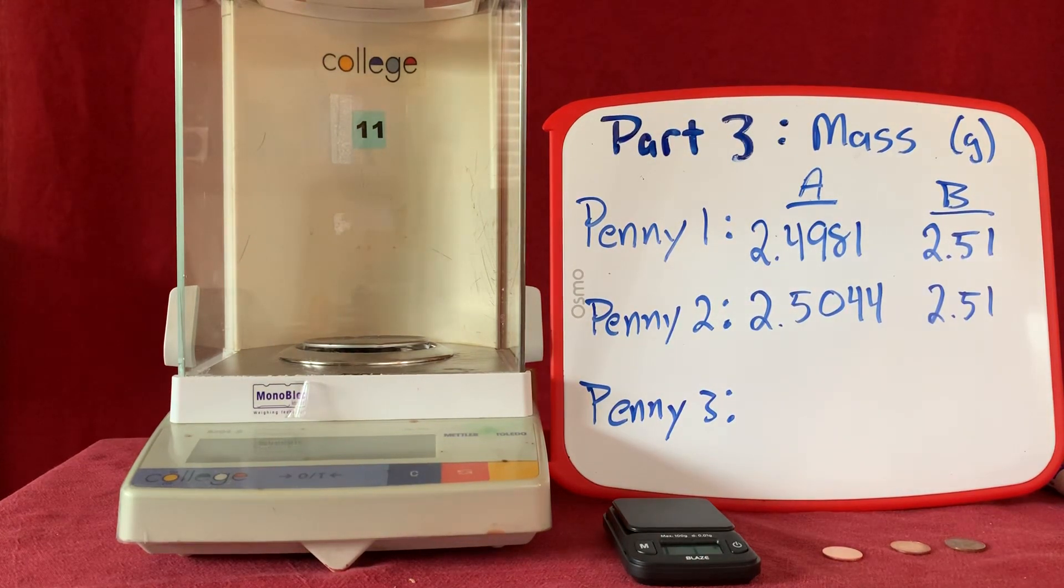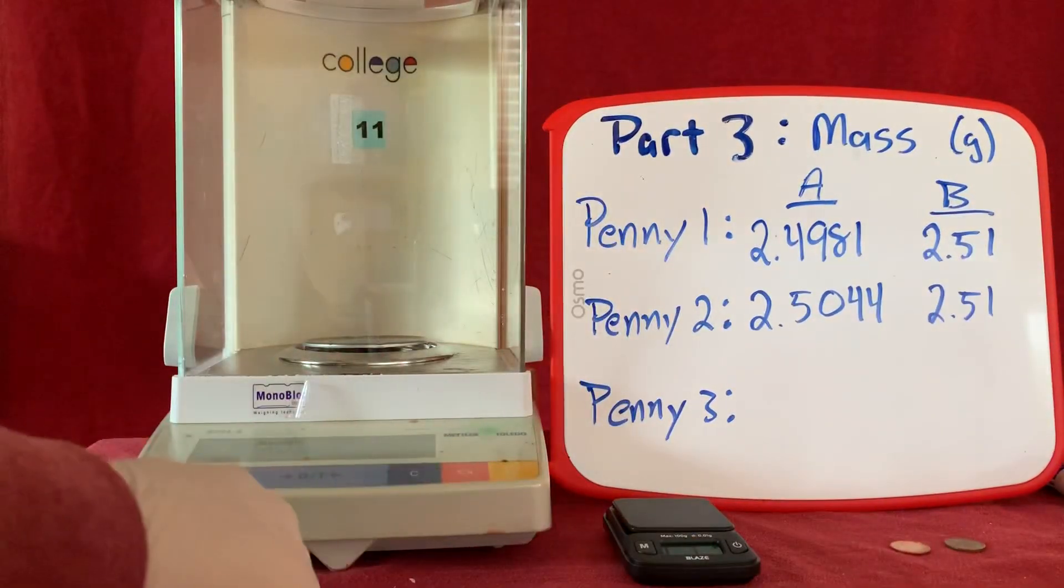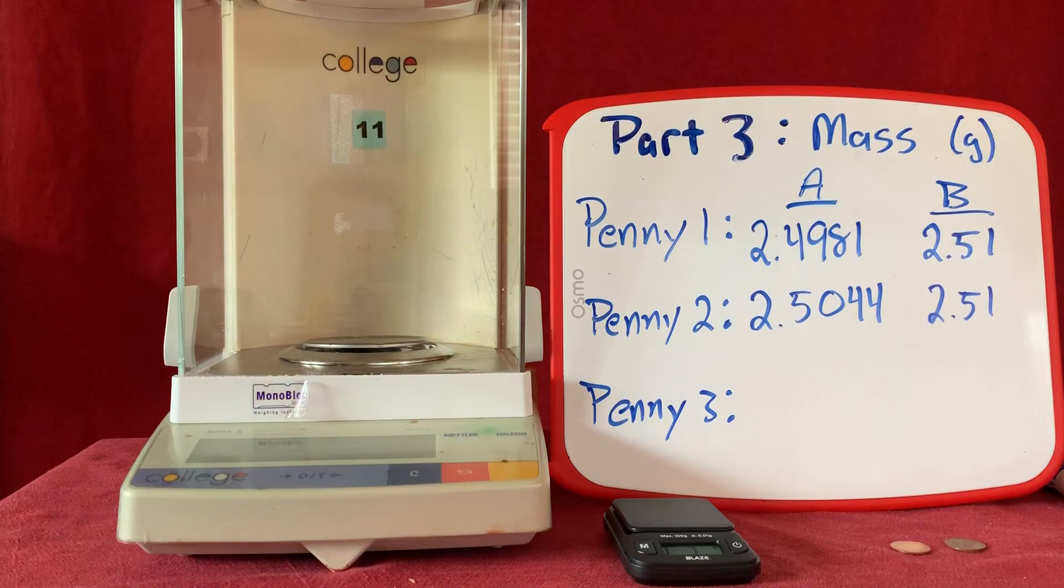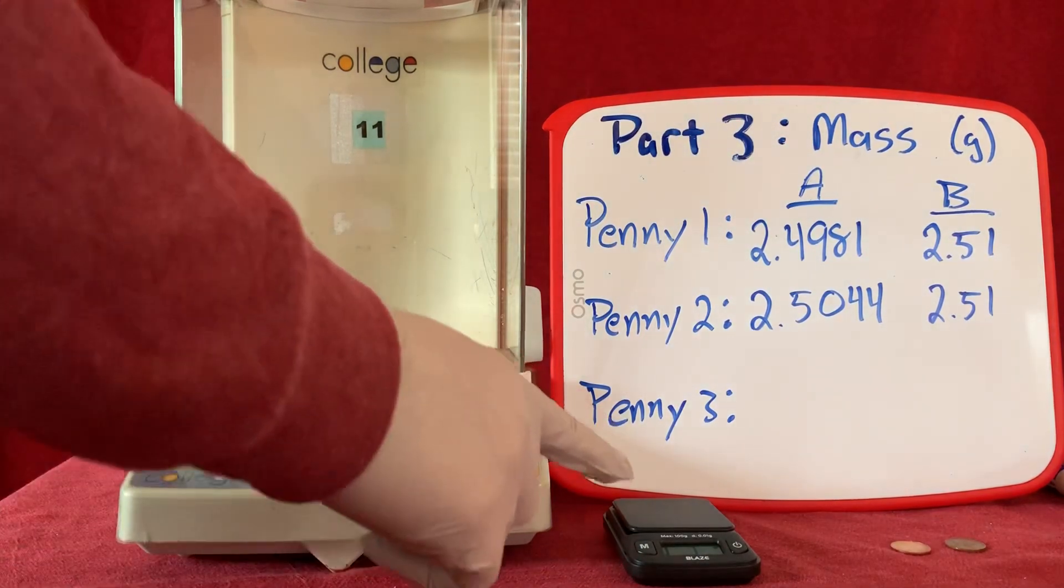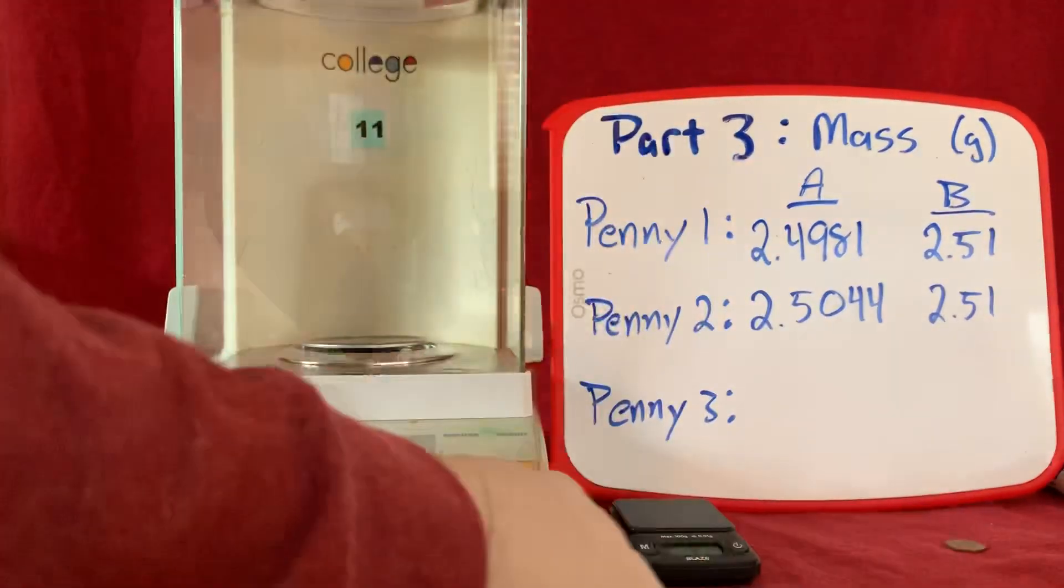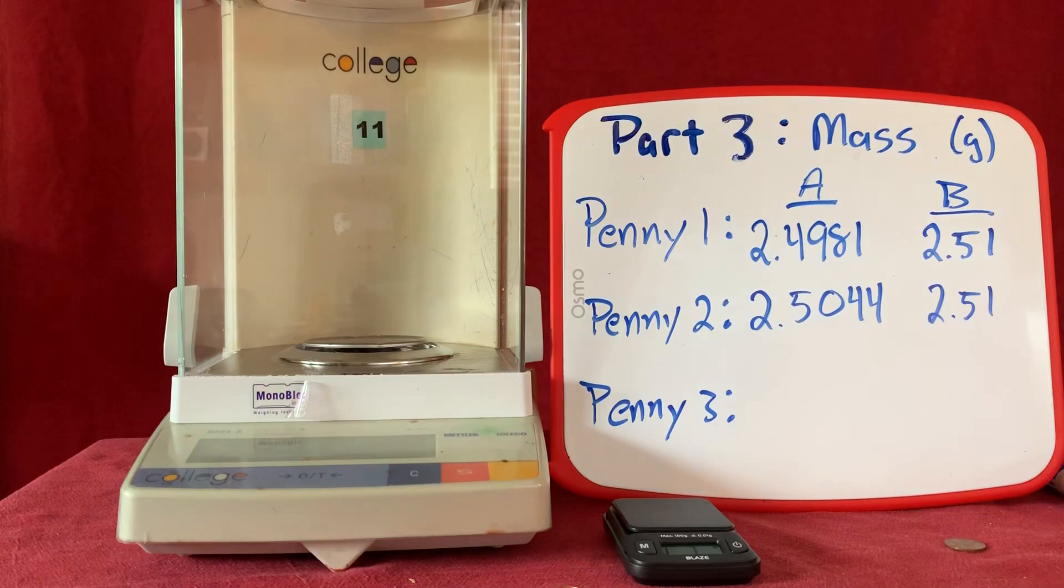Now you can see here I've started by already pre-measuring the masses of penny one and penny two. Penny one, this one right here, which I will move over a little bit, had a mass of 2.4981 when measured on the lab balance and 2.51 when measured on the home balance. Penny two had similar masses of 2.5044 grams and 2.51 grams when measured on the two different balances.